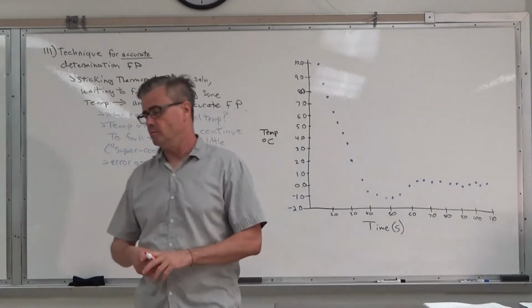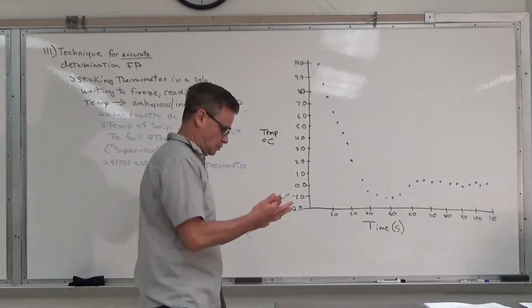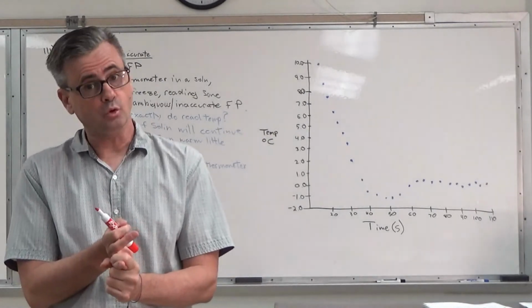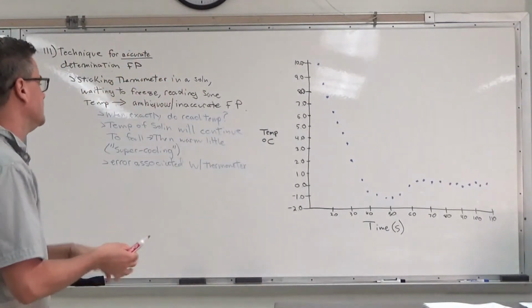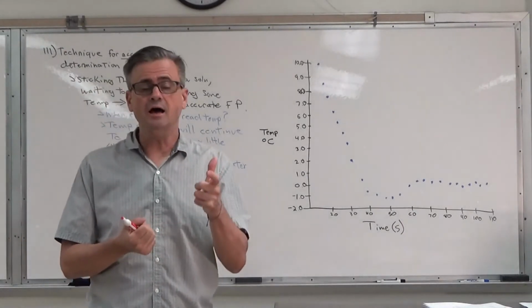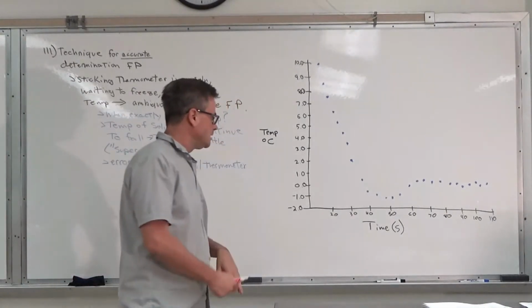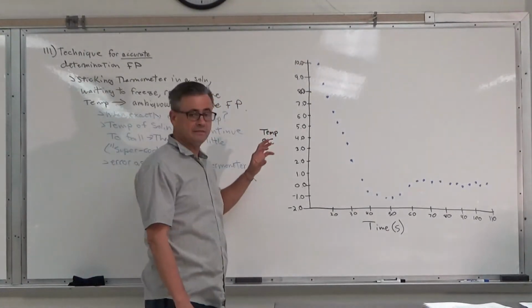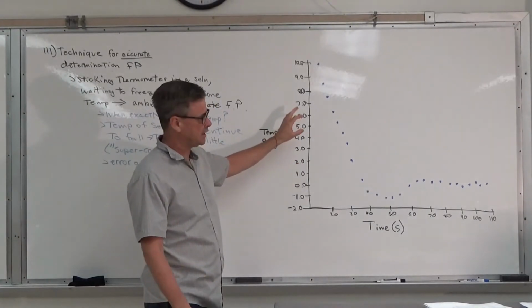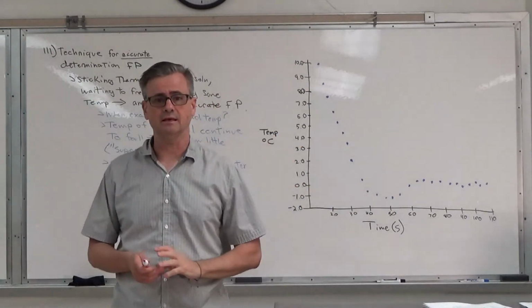You're going to do something like this 3 times. You're going to do it once for pure water. You're going to do it once for sodium chloride solution, and you'll be given data. And then you're going to do it once for an unknown non-electrolyte. I'll talk about that in a second while you're doing that one. You're going to take the data that you're given, put it into Excel, and then graph it like that, do a scatter plot like that.